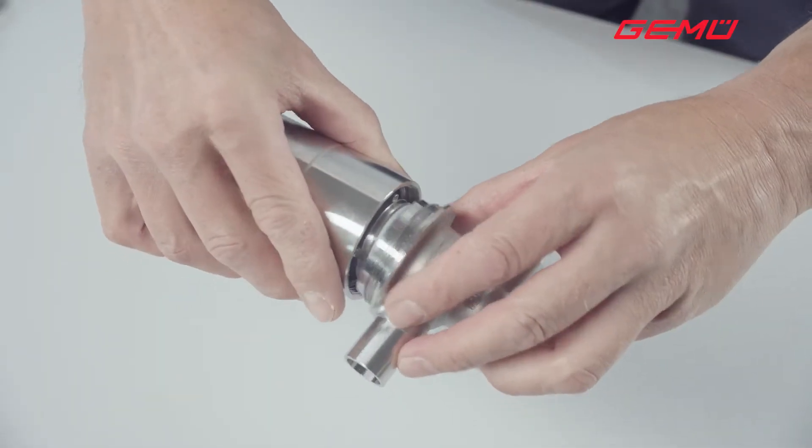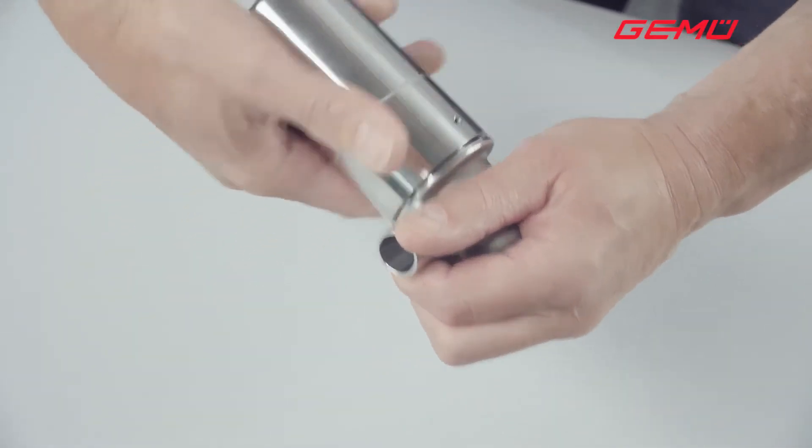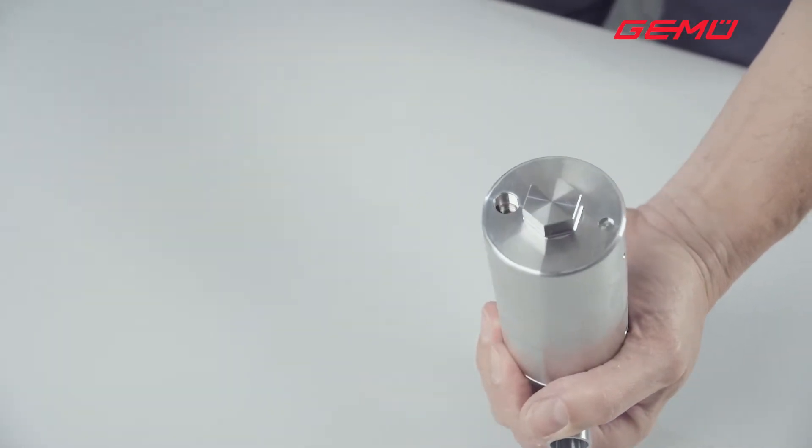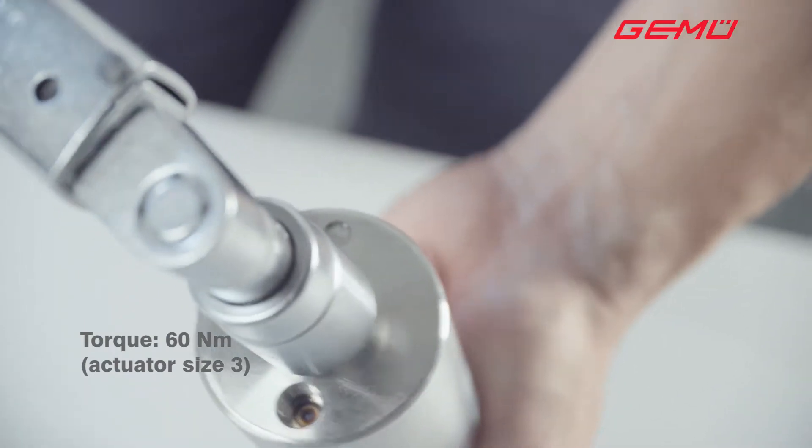Now screw the actuator onto the body in a clockwise direction until it is hand tight. Then tighten it using a torque wrench.